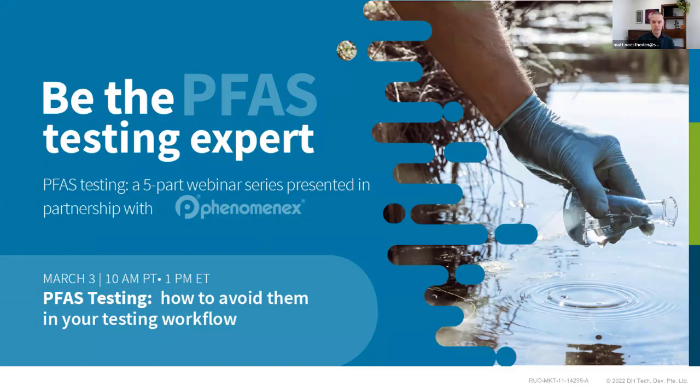It is a joint webinar series between ourselves at SCIEX and our partners at Phenomenex. In this first session, we'll be talking about how to avoid PFAS in your testing workflow. These compounds are everywhere, and our speakers today are going to have some great knowledge to impart on how you can avoid them in your lab and in your processing workflows.